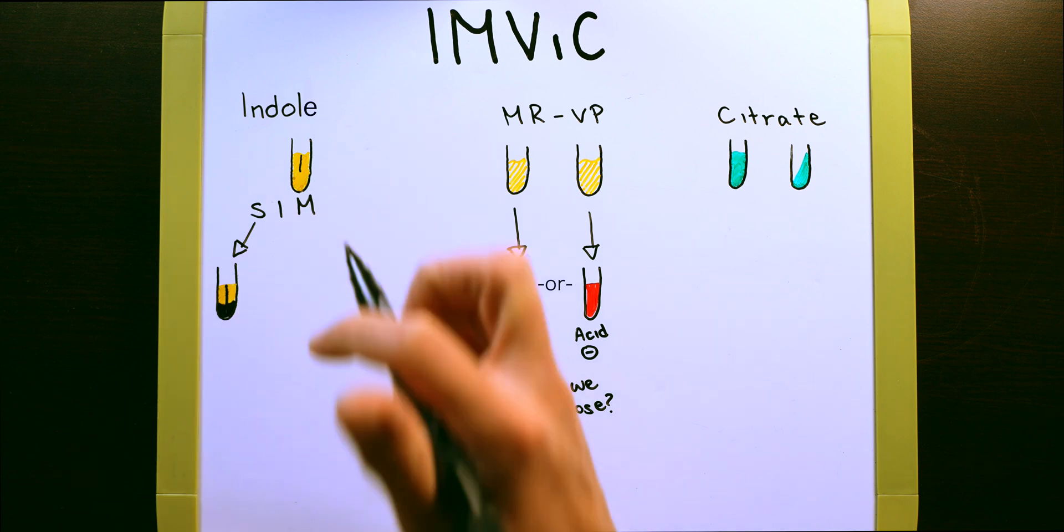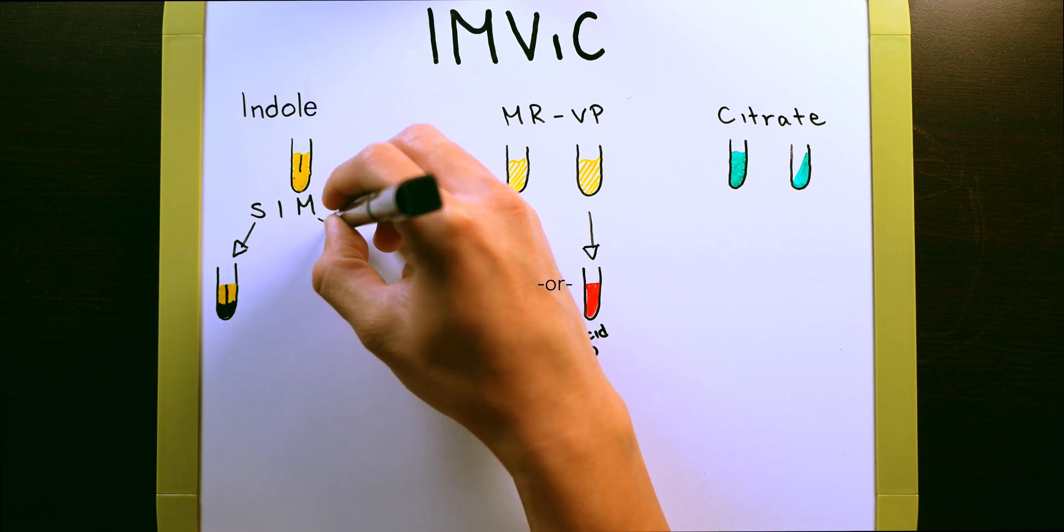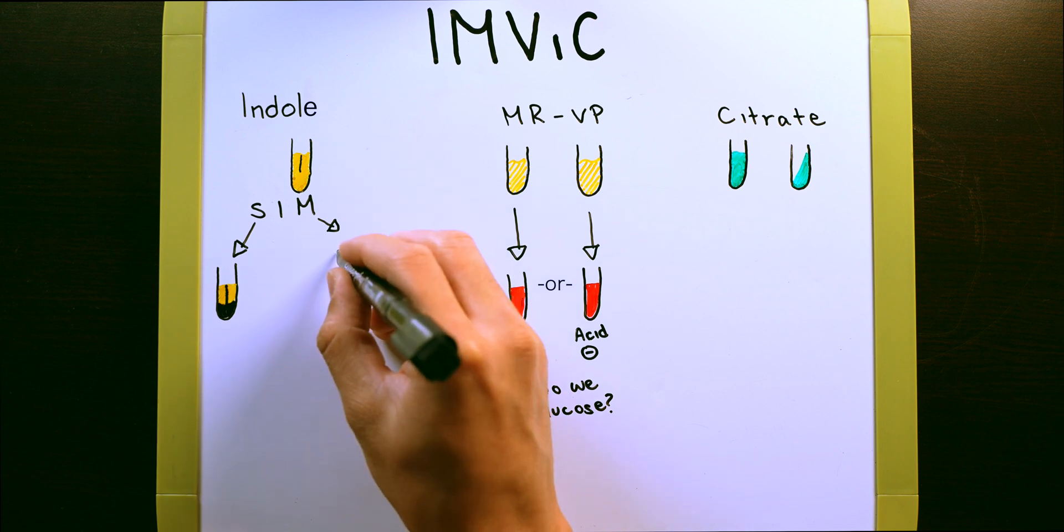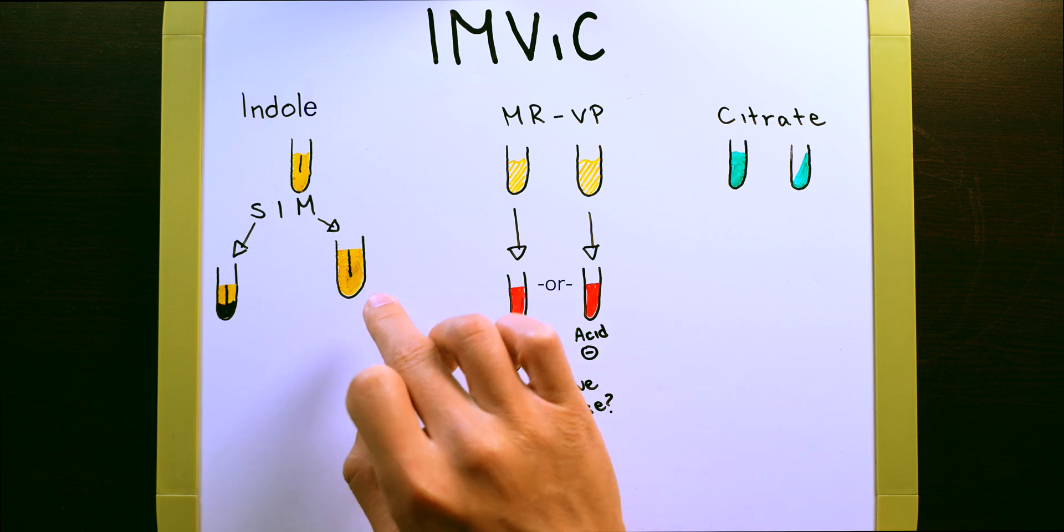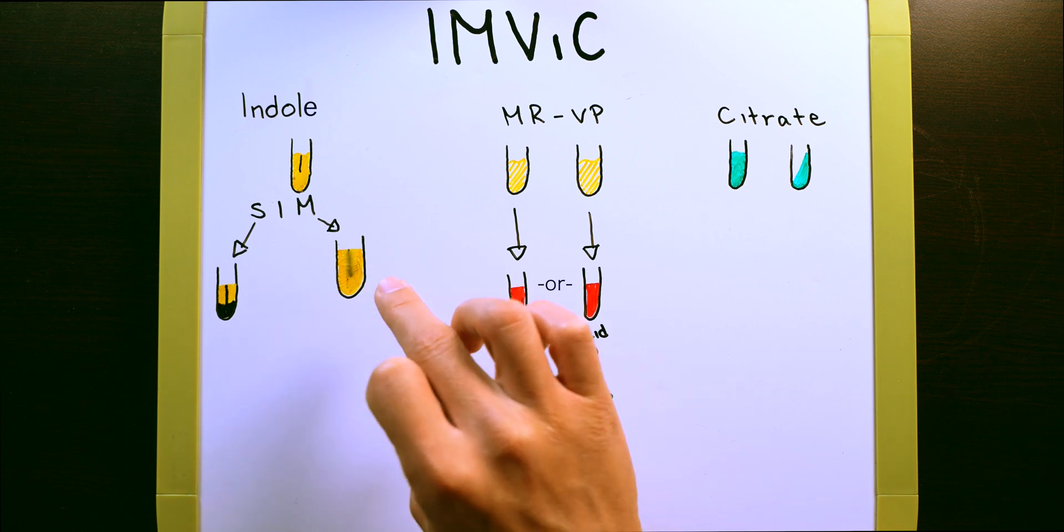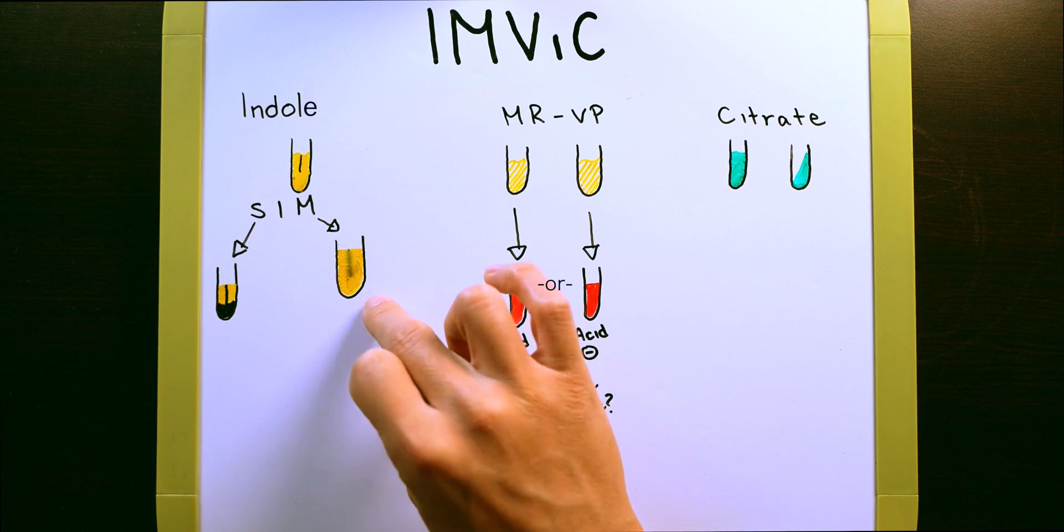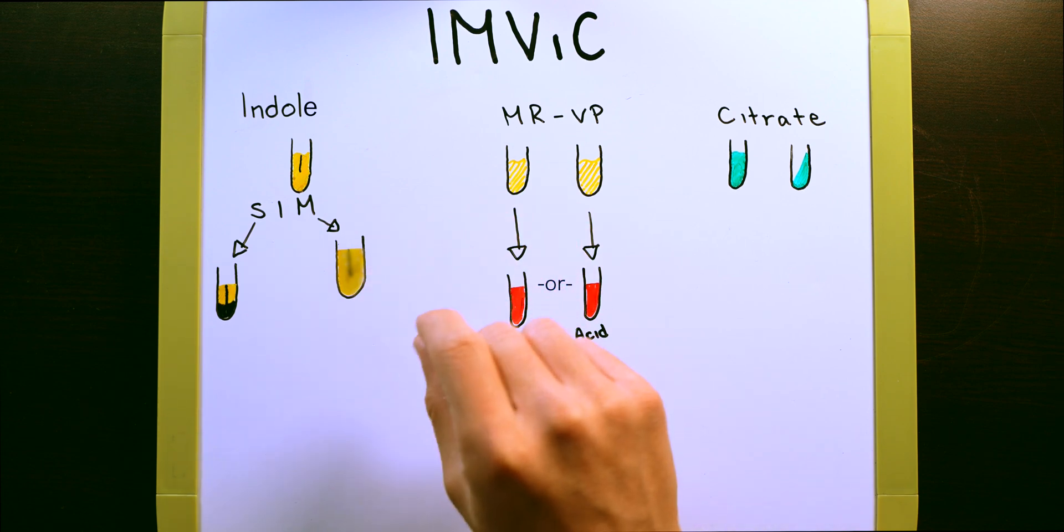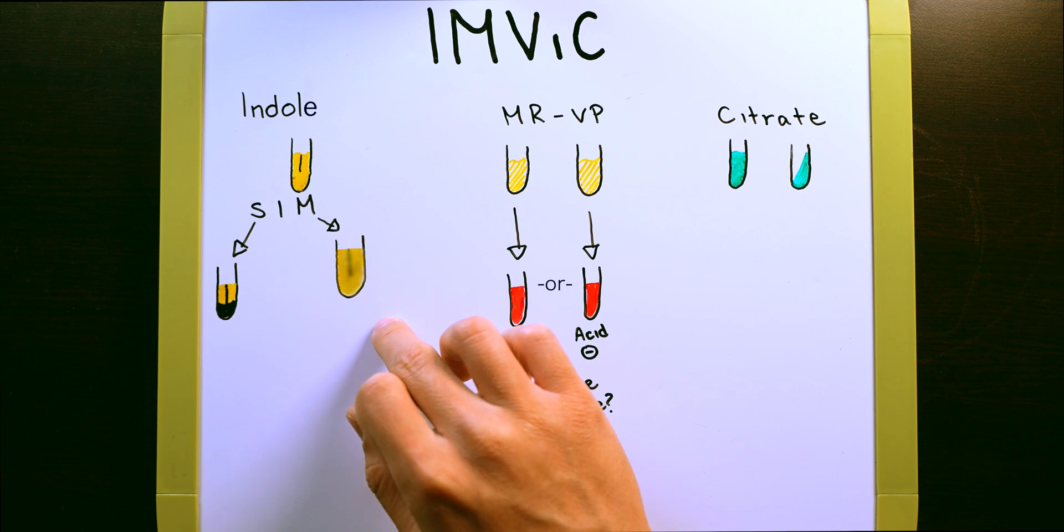We're going to skip indole really quick to jump over to motility. Motility is not so cut and dry as our sulfur test. But here, you're going to want to look at the test tube with your motility portion. Near the stab site, you might see some cloudiness. But this is just some growth of the bacteria. If you were to have a positive motility test, the whole test tube will be cloudy. Not just a little bit of it near the stab site, but the entire test tube will be cloudy.